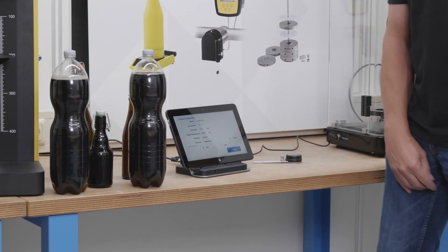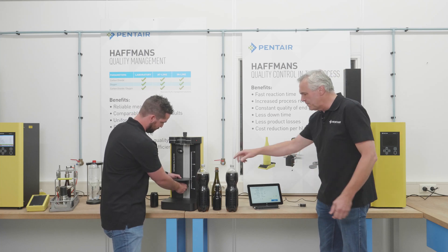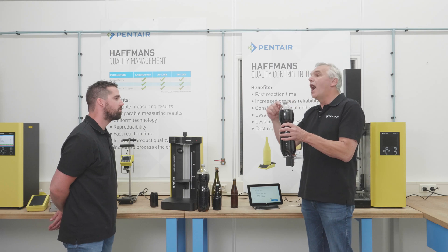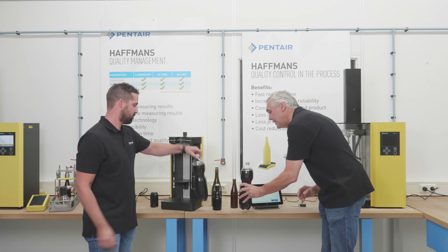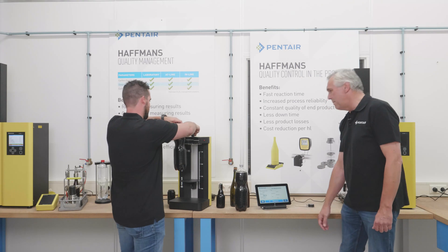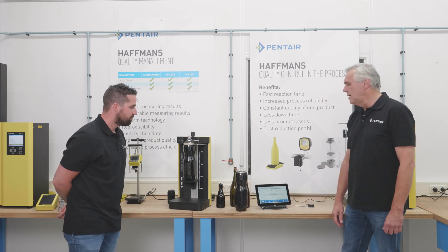I will go to View Products. It tells you that the stage should be adjusted to 329 millimeters. So please adjust the stage. At 329 millimeters, the path through the bottle is approximately 51 millimeters, so the instrument knows the path length for CO2. Please put the bottle in — I will prepare it by shaking the bottle to an equilibrium, then placing it in without heating it with your body heat — and I start the measurement.